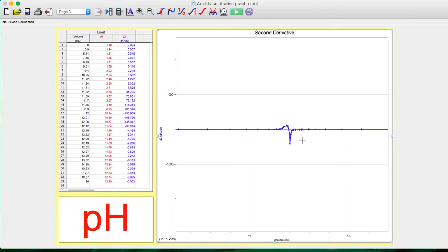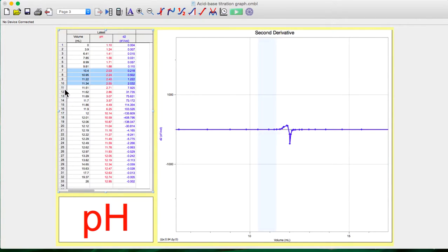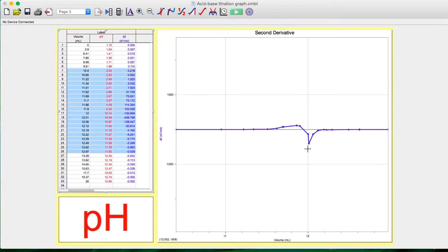Now, in order to do that, we're going to zoom in, and we're actually going to find an equation of a line. So to zoom in here, it might take a couple of tries, but what you can do is go over here and, somewhere between 10 and maybe 13, I'm going to choose my data that goes from 10 to 13, and then I'm going to click on zoom, and it's zoomed in here.